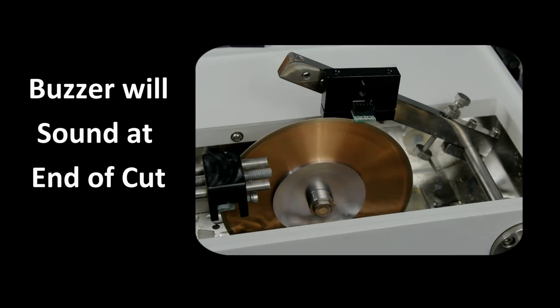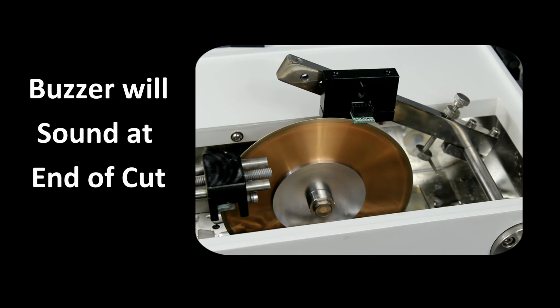After the cut has been completed and the shutoff switch is engaged, a buzzer will sound to signify that the cut is finished.